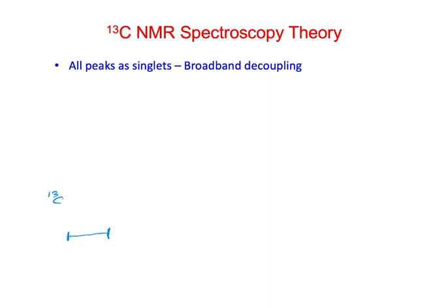So if we have a 400 megahertz NMR, we call it 400 megahertz, which would mean that the protons are resonating at roughly 400 megahertz frequency. The carbons, remember, because the magnetogyric ratio is 1/4 of that, would be resonating at roughly 100 megahertz, right? So we are going to have a C13 channel at that frequency, and then we'll see we have one at a proton frequency as well.